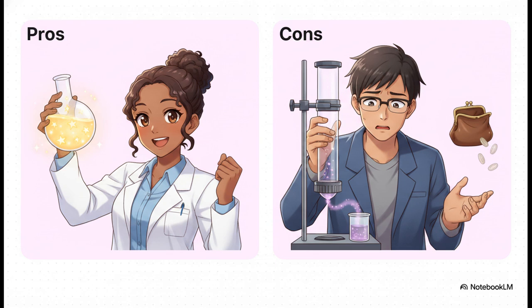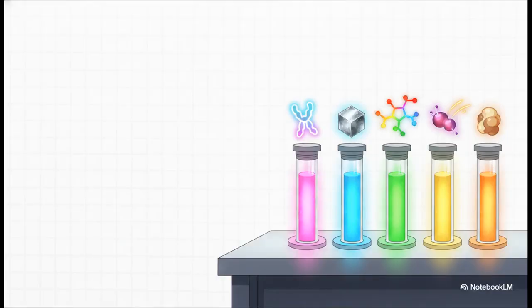But we've got to weigh that against the practical limitations. Affinity media can be insanely expensive. You also have to worry about the immobilized ligands degrading or leaking off the matrix over time. And perhaps the biggest hurdle, you absolutely must have prior knowledge of your target's specific binding partner to even design the column in the first place. No partner, no purification.